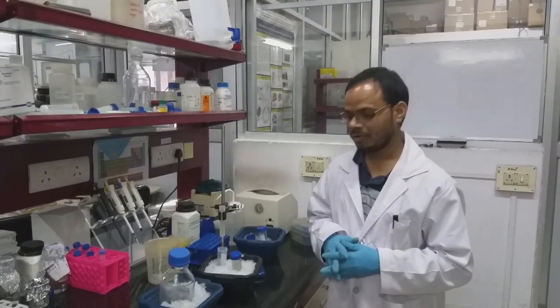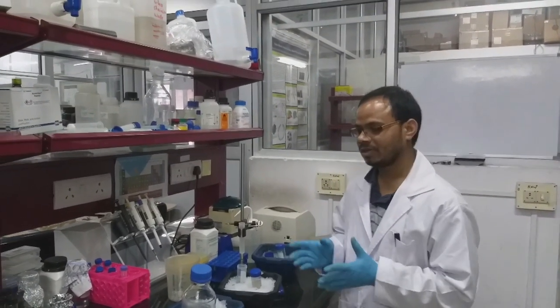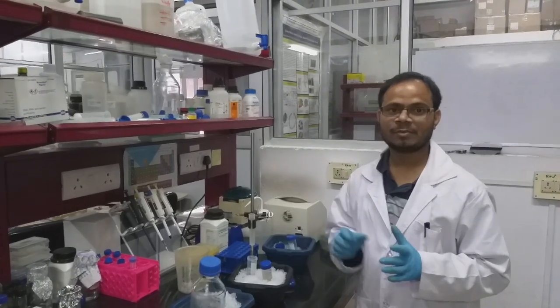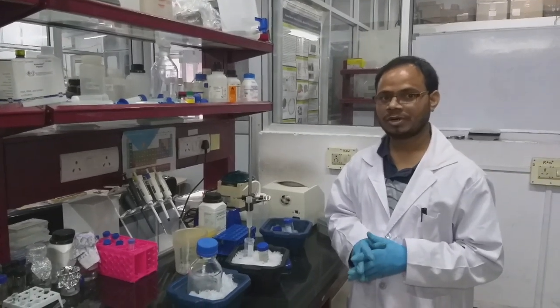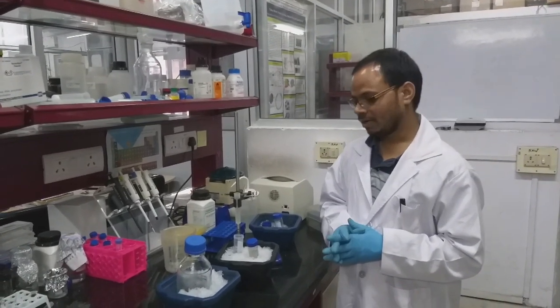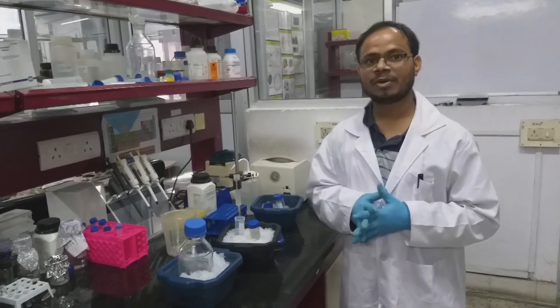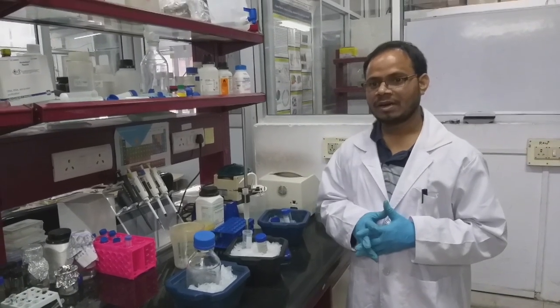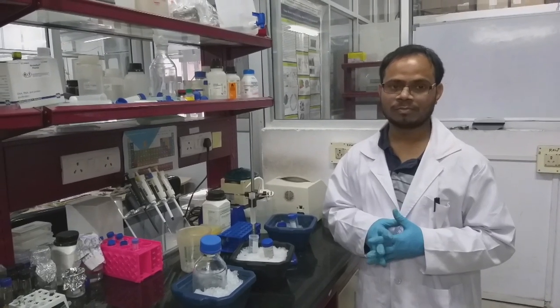While doing purification, we have to remember that every time you introduce a new buffer, you have to collect the fraction, and this can be used for running SDS gels and testing the purity of the samples. Also the flow through and washing fractions that we have collected, we have to keep safely. Only after verification of the gel, we can throw them.